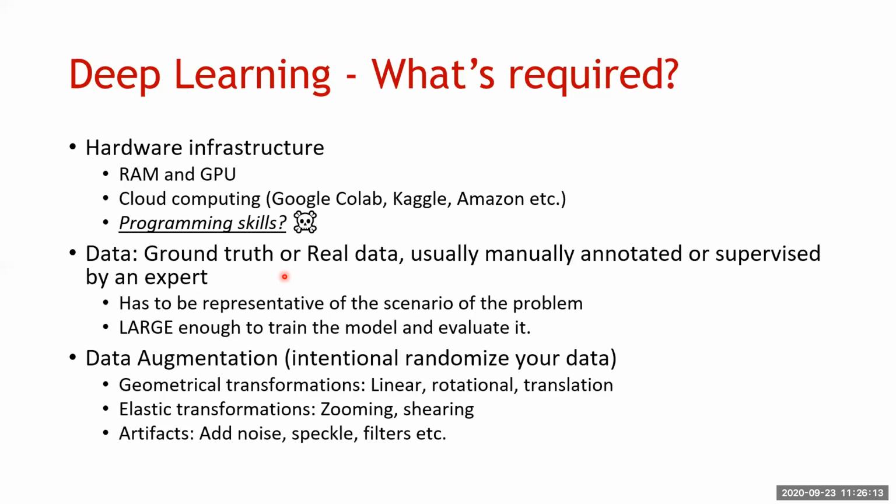Unfortunately, there will be manual annotation, especially for something like segmenting cells. There are things now you can do so that you don't have to sit down and do it yourself. But yeah, data augmentation was kind of the filtering, and it is basically a way to randomize your data and make your model more robust.